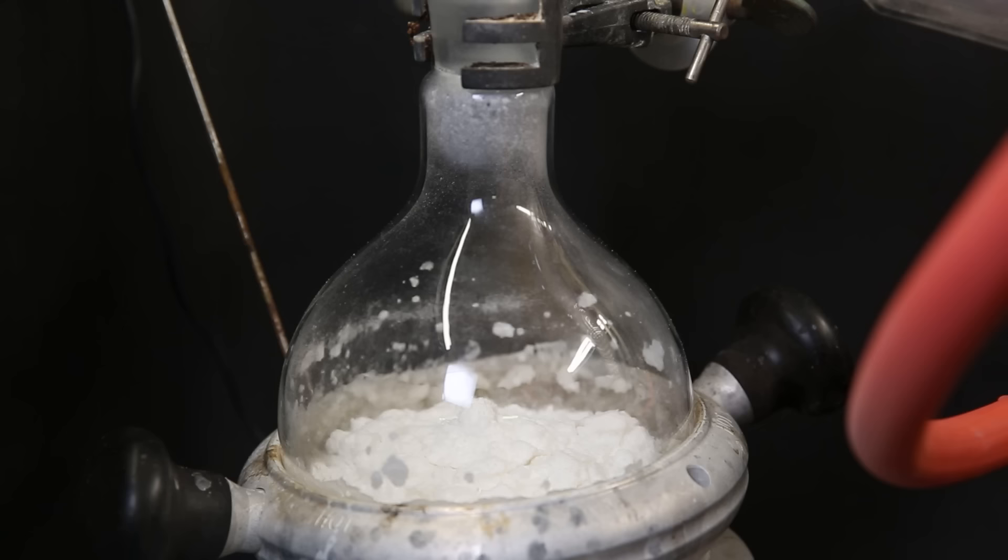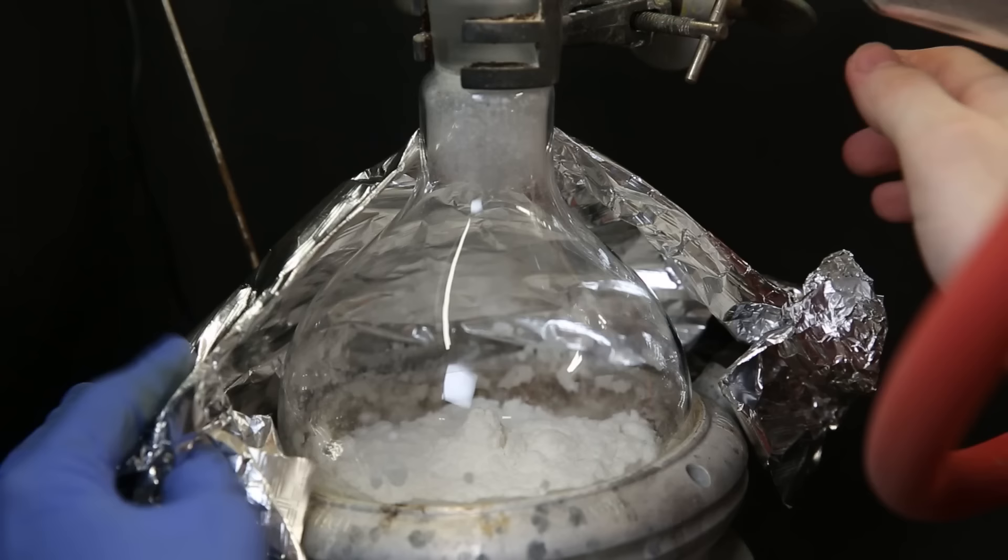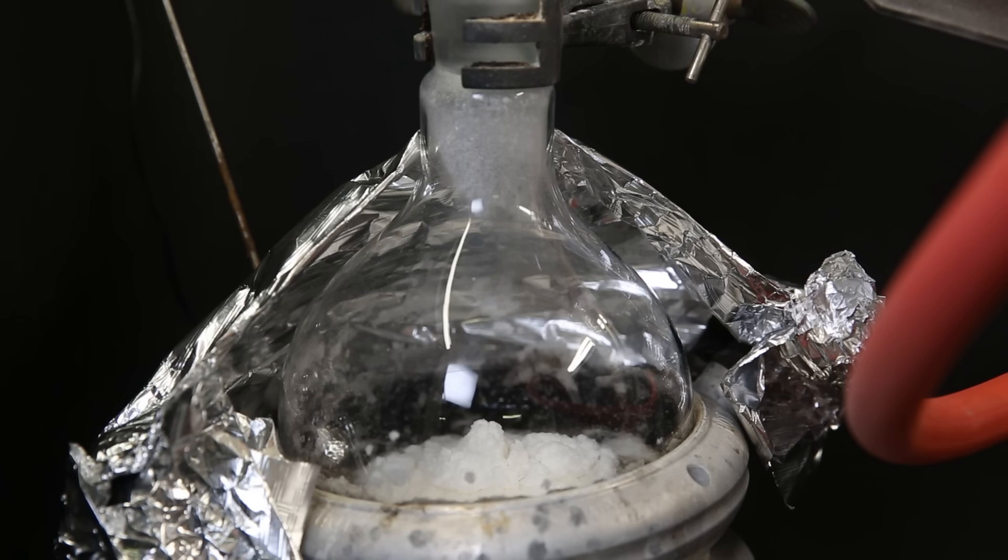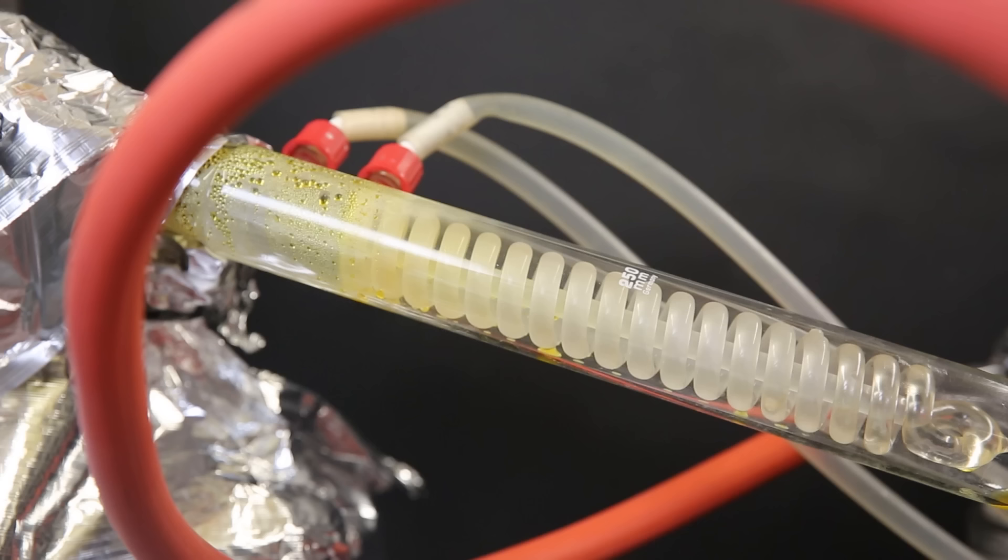Since the PEG 4000 will melt at a relatively low temperature, it will hopefully hold it all together. When the PEG begins to melt, I pull a vacuum and heat it to 190°C. At this point, the mixture begins to char and form mostly water, furfural and levoglucosanone. Yellow liquid starts coming over, and I leave it running until nothing more comes over.